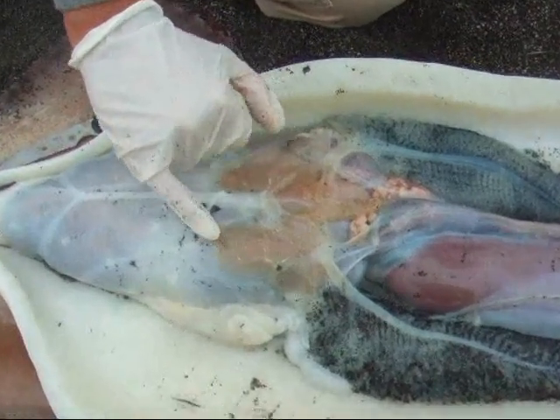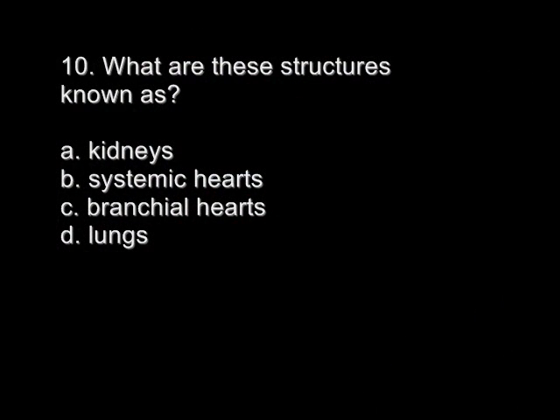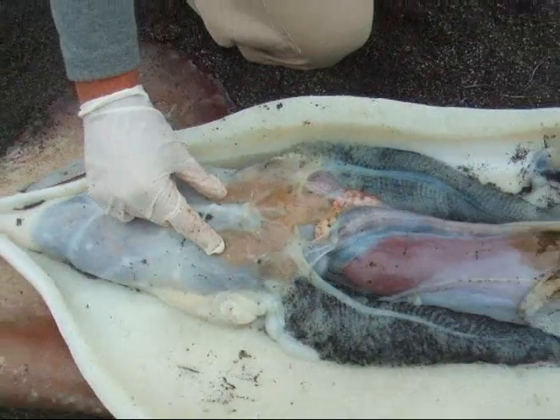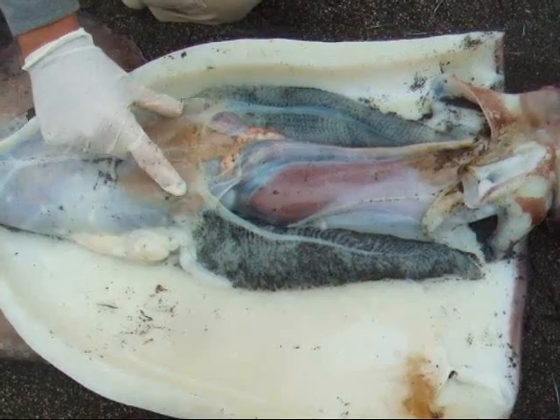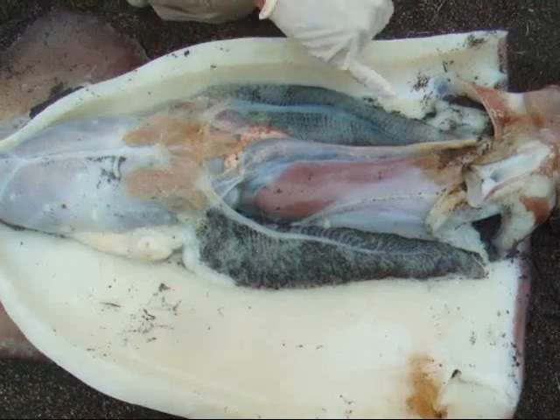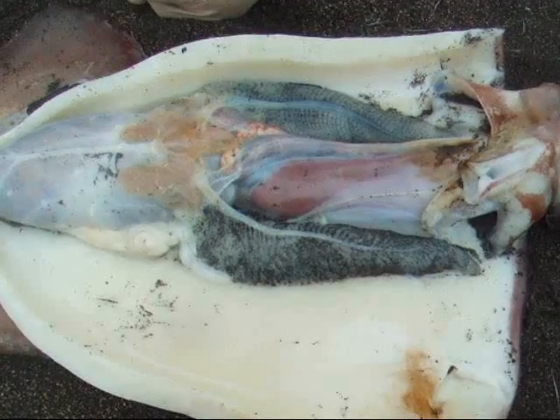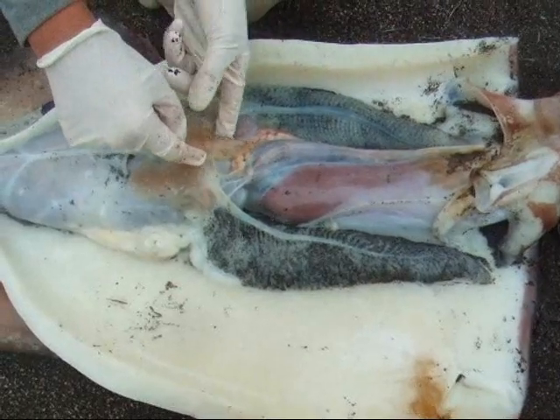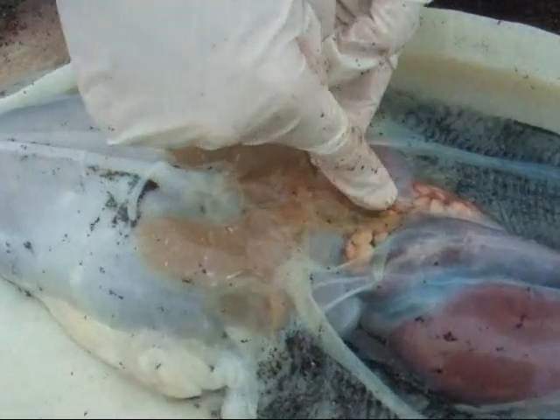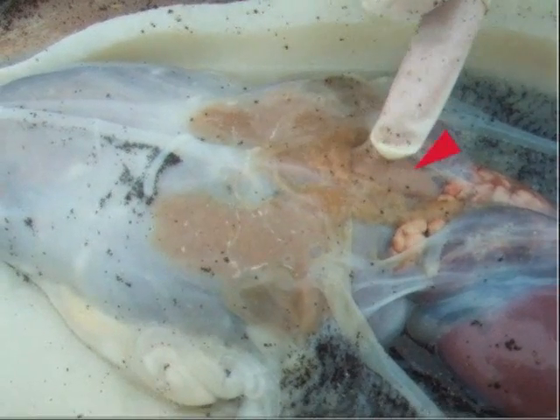What are these? These structures aid these structures. These two systems work together. There is also a structure underneath here. What is this? This single structure.